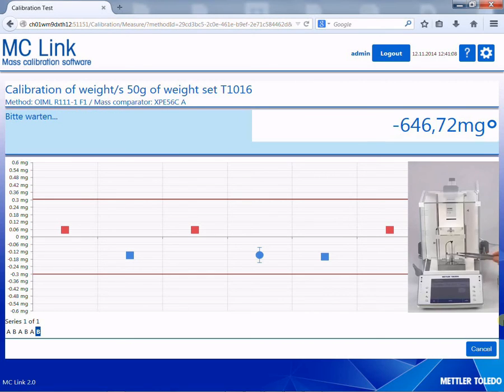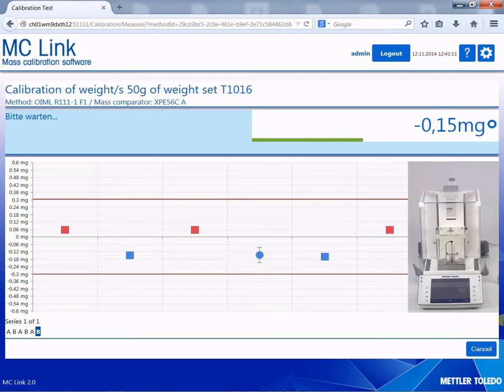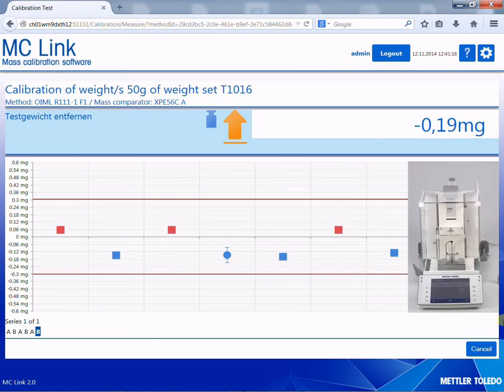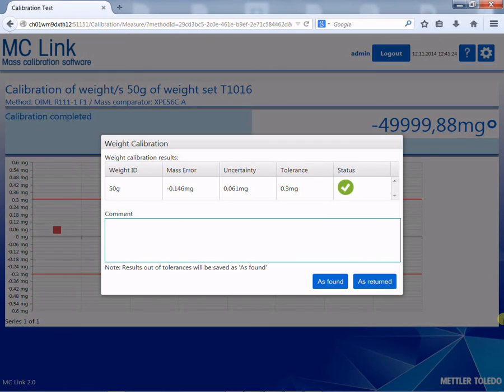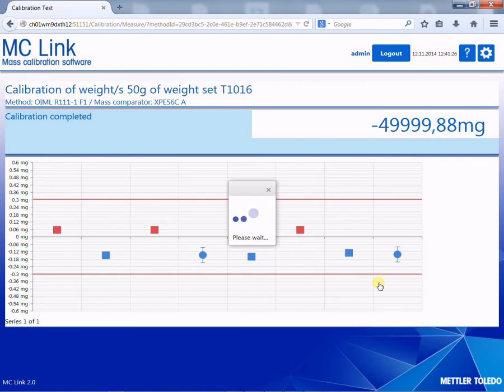The final result of the calibration is shown clearly on the laboratory client. Results within tolerances can be saved as found or as returned. Out of tolerance results can only be saved as found. This ensures that only correct results are enabled for the certification.